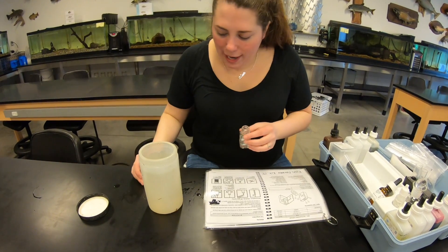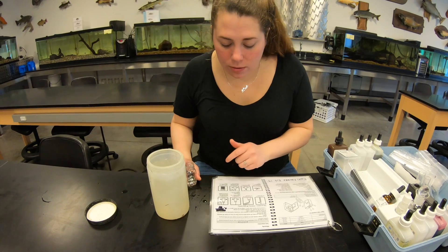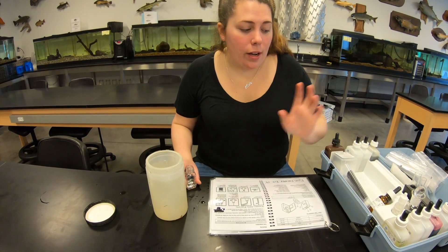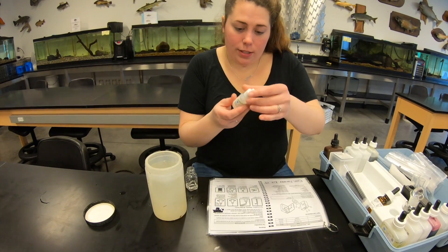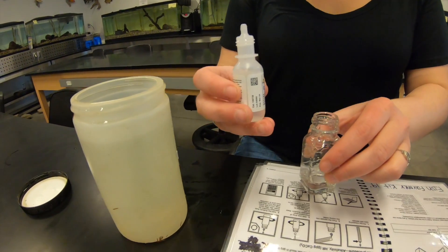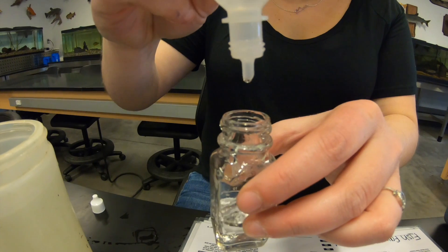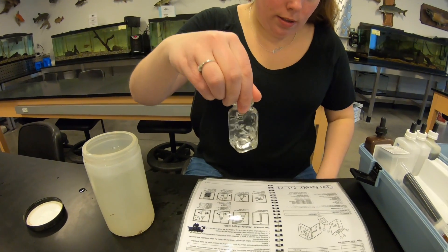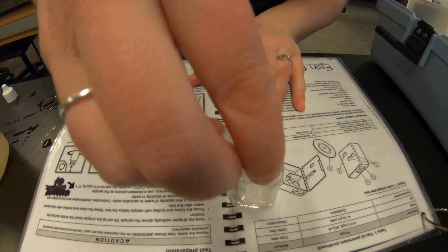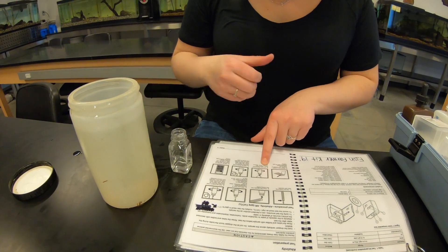The directions say to add one drop of phenolphthalein indicator solution and swirl to mix. If the solution is colorless, the phenolphthalein alkalinity is zero and you skip to step six. To get a proper drop, hold the bottle completely upright and squeeze once for a full drop. I'm not seeing any pink, so it looks like we can move to step six.